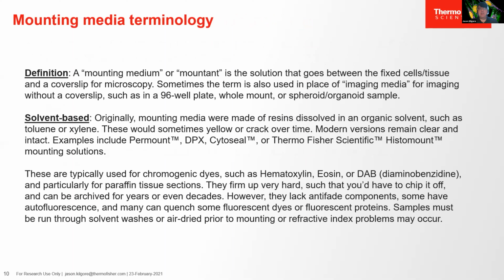So let's turn now to a quick discussion of anti-fade mounting media. I had the honor of developing some of those and still advise our R&D groups on that. What is a mounting medium? That's just the solution that goes between the slide and the cover slip to bathe your sample in. It's not always an anti-fade. An anti-fade is one that has anti-fade components, free radical scavengers added into it.